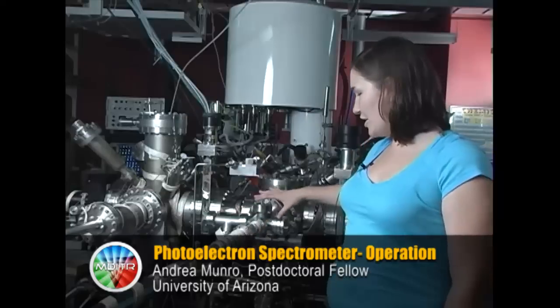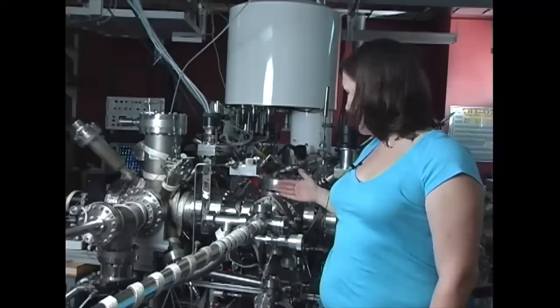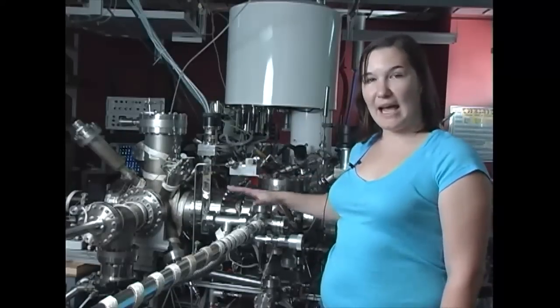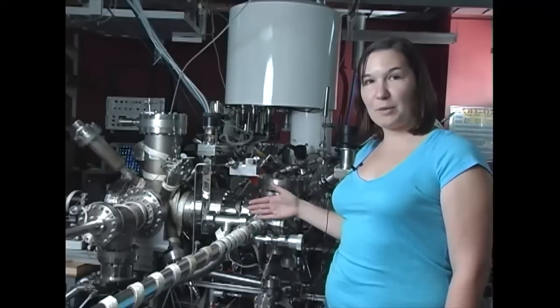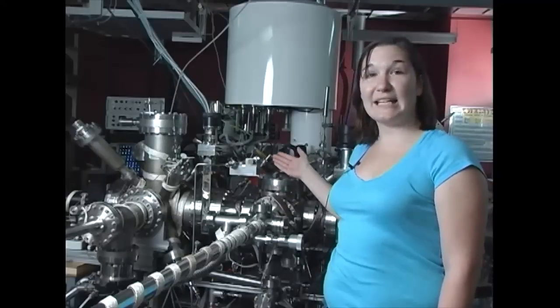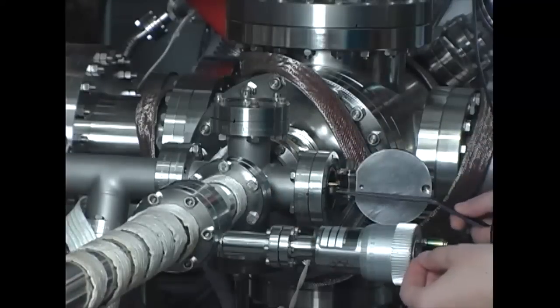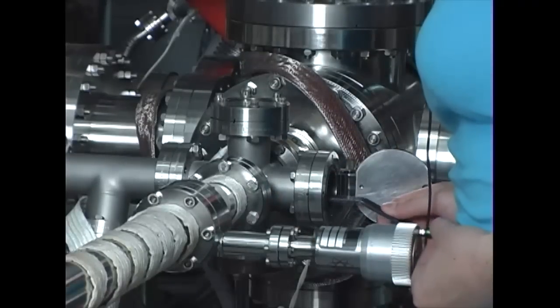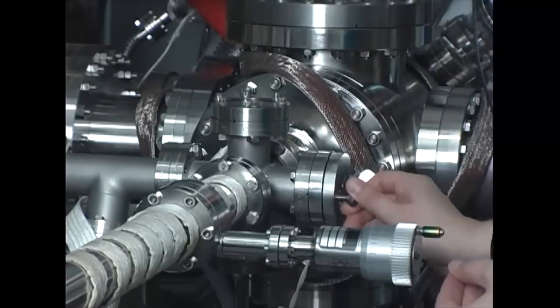When we want to load a sample into the Kratos, we use this fast entry lock. So this is a large evacuated cylinder that has a transfer arm in it. And we have a valve in between the regular chamber and this fast entry lock. So we can bring this back up to atmospheric pressure, load our sample, and quickly pump it down before transferring our sample into the chamber to do our analysis. So to load the sample, we put it on our little sample holder and put it onto the arm. Then we close the door and pump it back down.